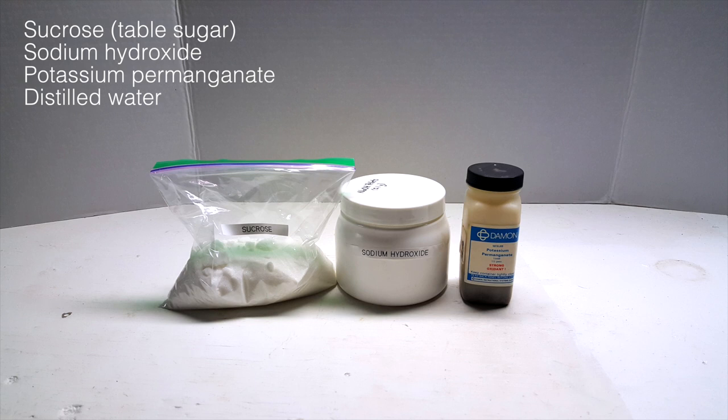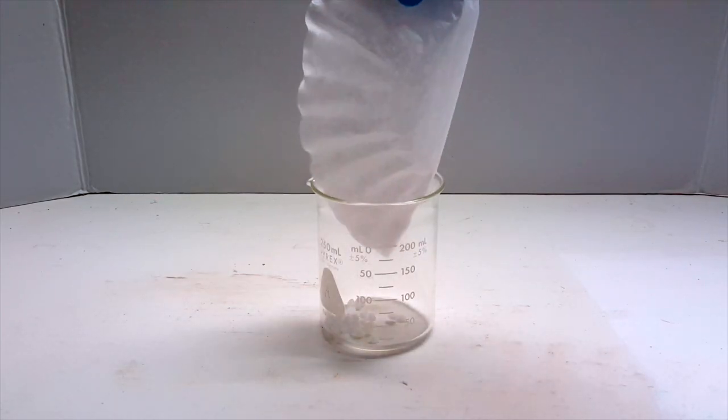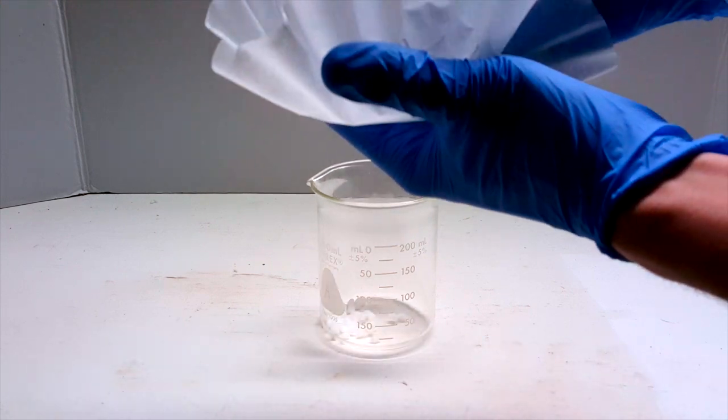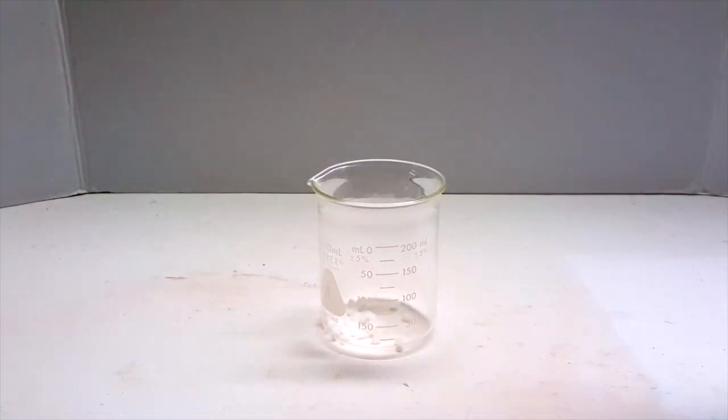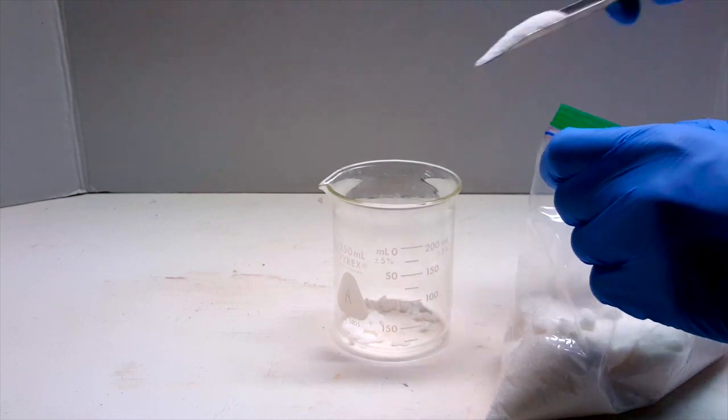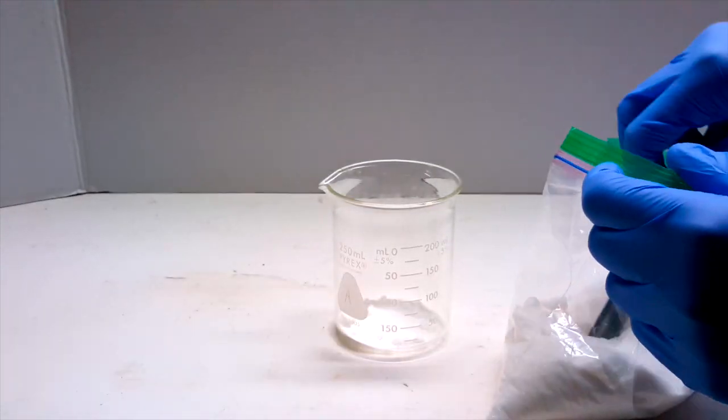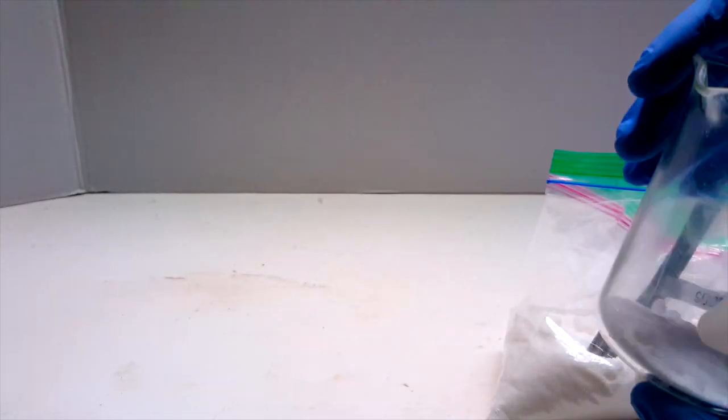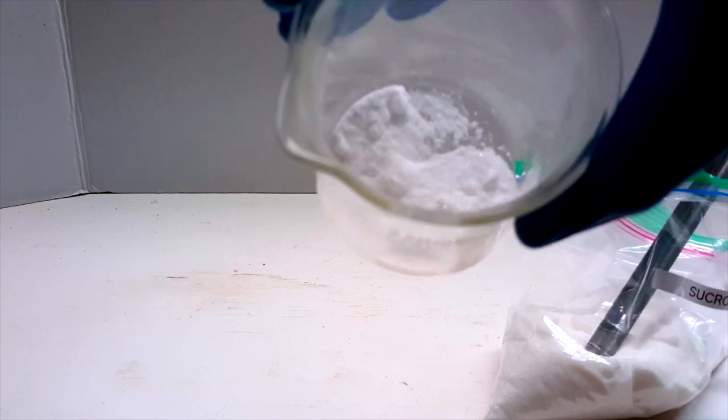The proportions of chemicals used are pretty arbitrary, and the concentrations will only really change the rate of the reaction. For the first run, I added 4 grams of sodium hydroxide to a beaker labeled A. Then I added enough sucrose to entirely cover the sodium hydroxide pellets. Again, an exact amount is really not necessary.